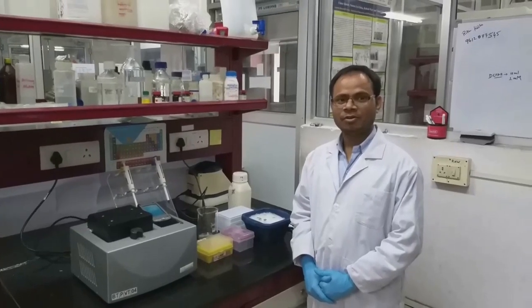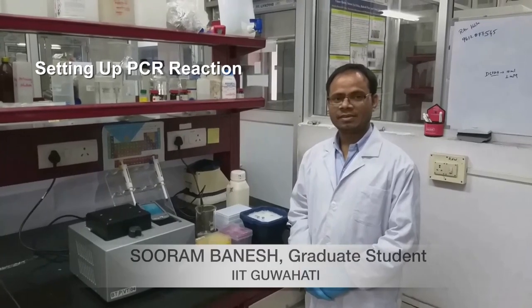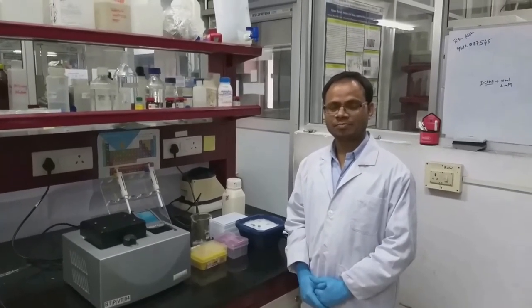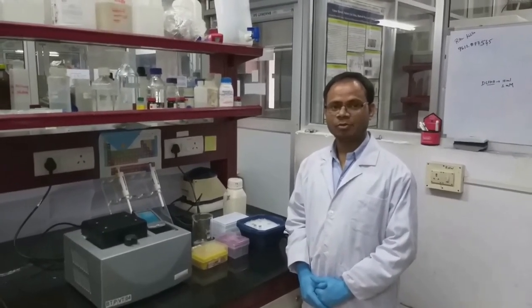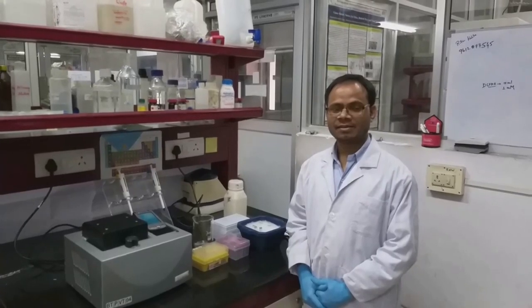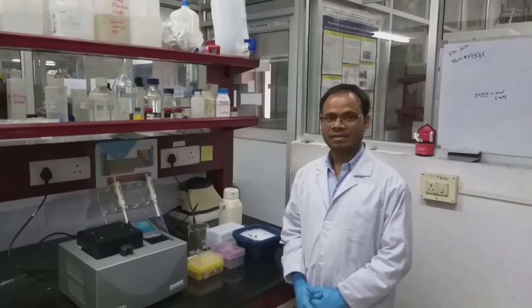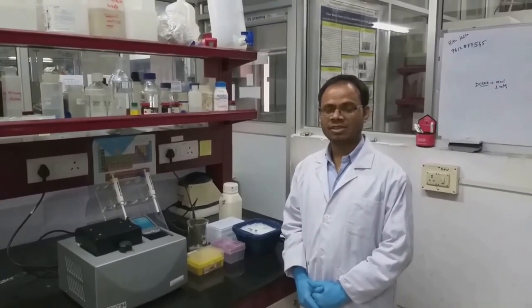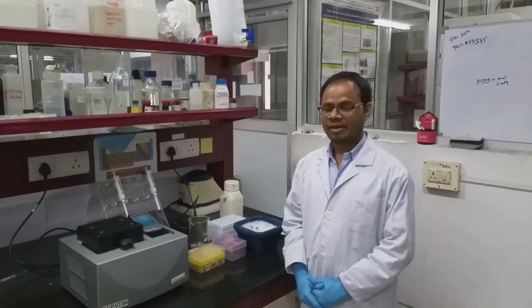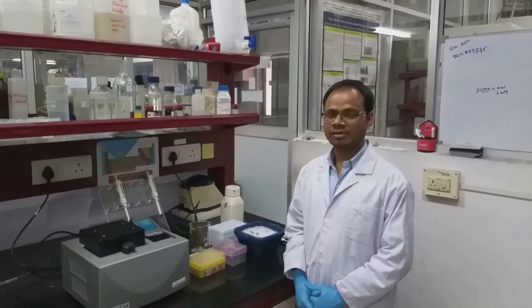In this video, we'll be demonstrating how to set up a PCR reaction and analyze the results using agarose gel electrophoresis. PCR, or polymerase chain reaction, is a widely used molecular biology technique to amplify a particular segment of DNA. It is also employed in biomedical research and forensic medicine. The main application of this polymerase chain reaction is cloning.